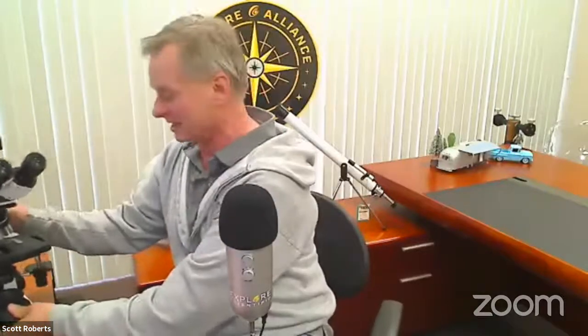So before I dive into my presentations, I do want to show the equipment that I'm using. This is a Bresser Science Infinity microscope. It's a biological microscope. I have a dark field adapter that I'm learning how to use, but you can see there's a camera up on top, a binocular head, and this is called a trinocular head, actually, and it works out really well. For a beginner like me, it's a solid instrument, good optics, and very versatile with LED illumination and a very precise mechanical stage and all of that.